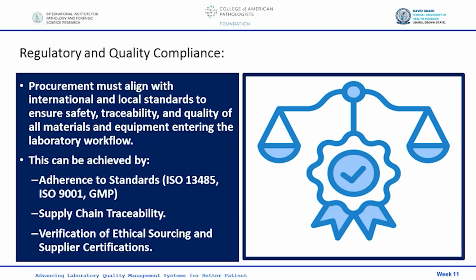This is very important for product recall situations and also for verifying batch related quality concerns. Okay, for example, if in the lab a test is done for a particular patient and there is a challenge, you should be able to trace back to the reagents, trace back to the suppliers, trace back to the quality standards.